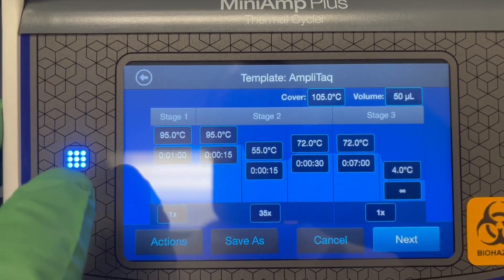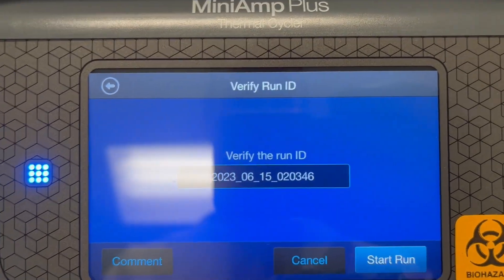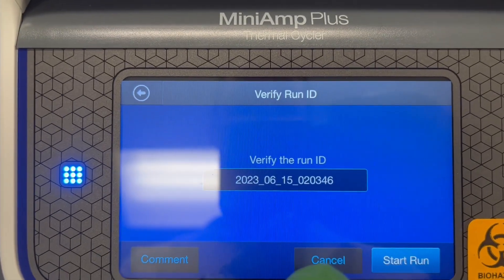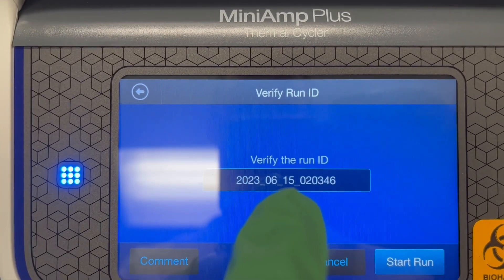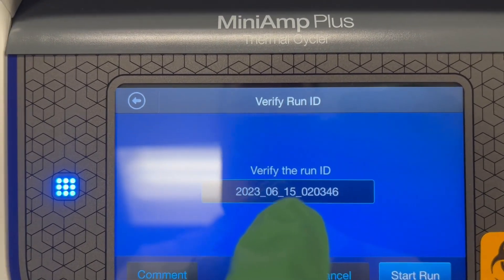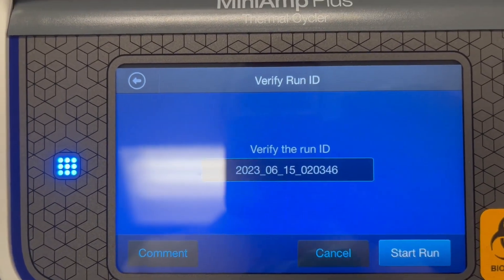Once you have this set up, you can see that at the end it will hold at four degrees. Hit Next, and it allows you to name the ID of the experiment. You should put in your name or your PI's name and make sure you keep the date and time of the experiment, and then you can start your run.